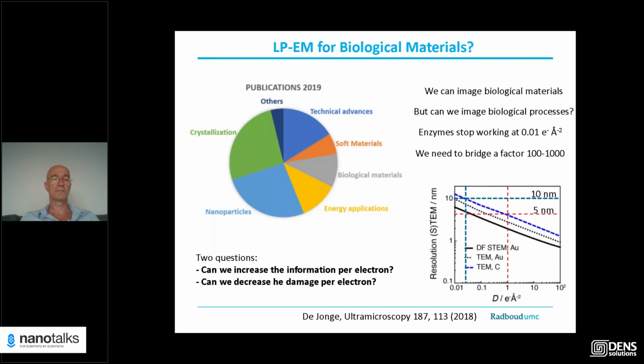All right. Thank you very much for your question. I have another question here from Tanya Prozorov. She first, yes. She first thanks you for your presentation, and she asked what camera was used for image acquisition in your work with LPEM imaging of polymeric vesicles formation. Hello, Tanya. Nice that you are here.